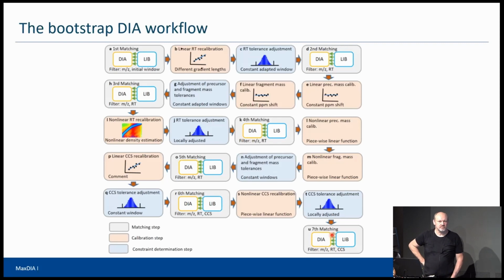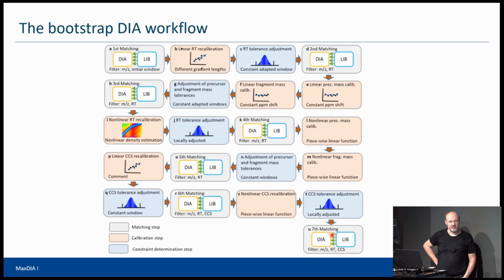So in the very beginning, when you were talking about the fragmentation windows that differentiate these data types, is it the instrument that defines where those windows go, or is that the algorithm? It's the instrument. But you can of course set them. You would have to modify the method that is used there, right? And you could then also choose your own windows, but it's done in the instrument. Thank you.